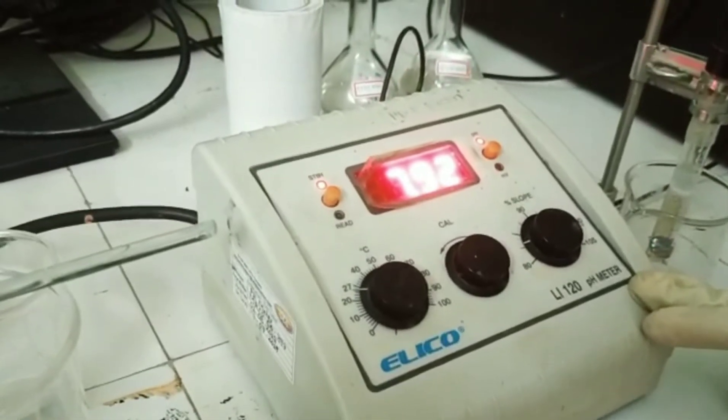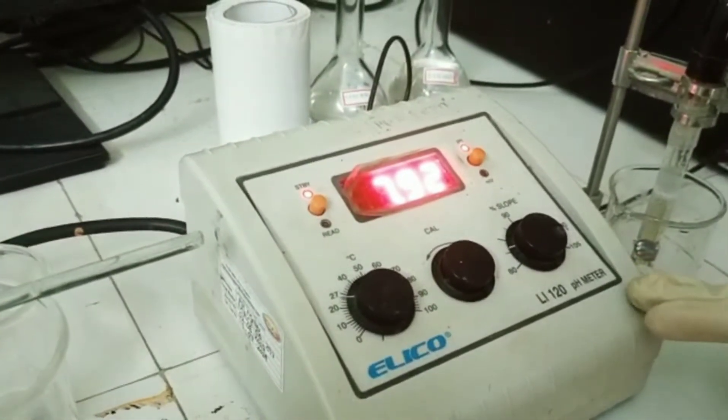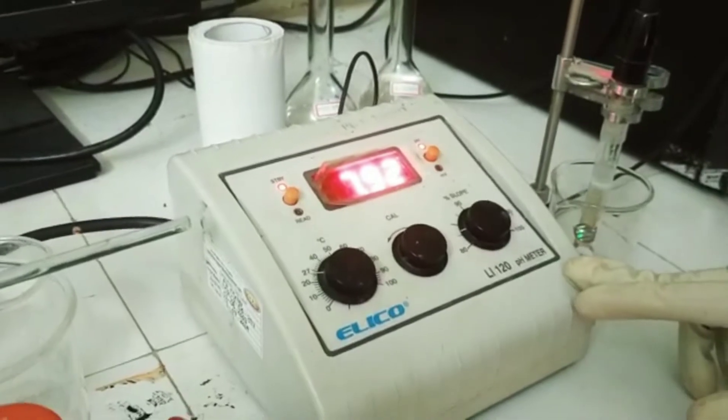In my previous video, I have shown you the working of this instrument and calibration of this instrument.